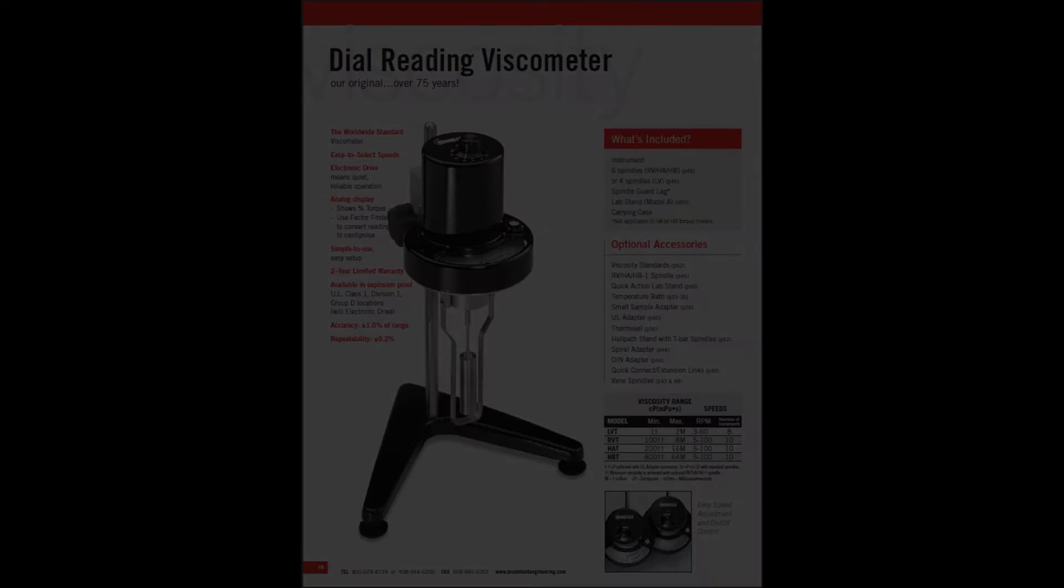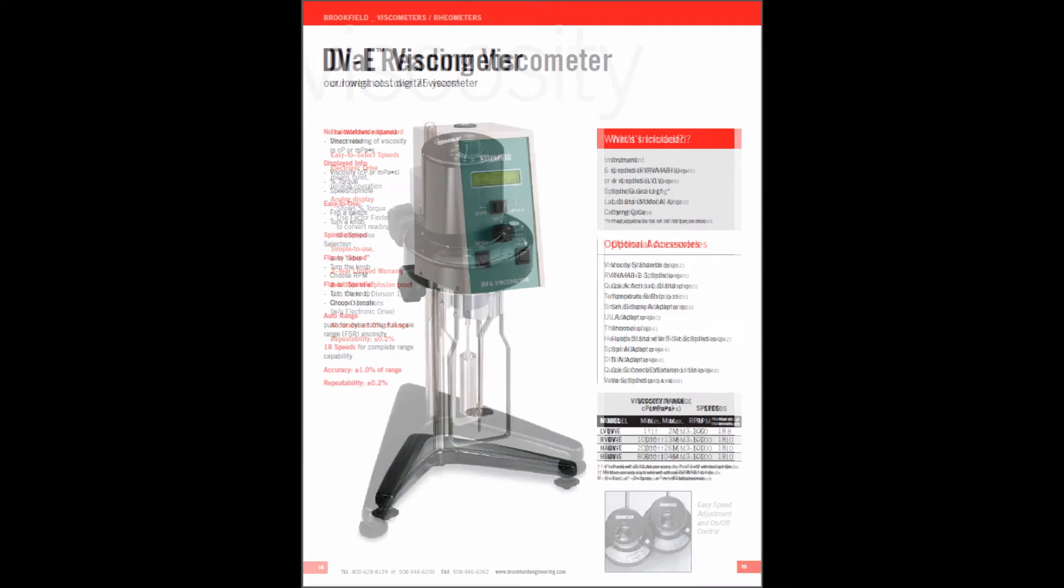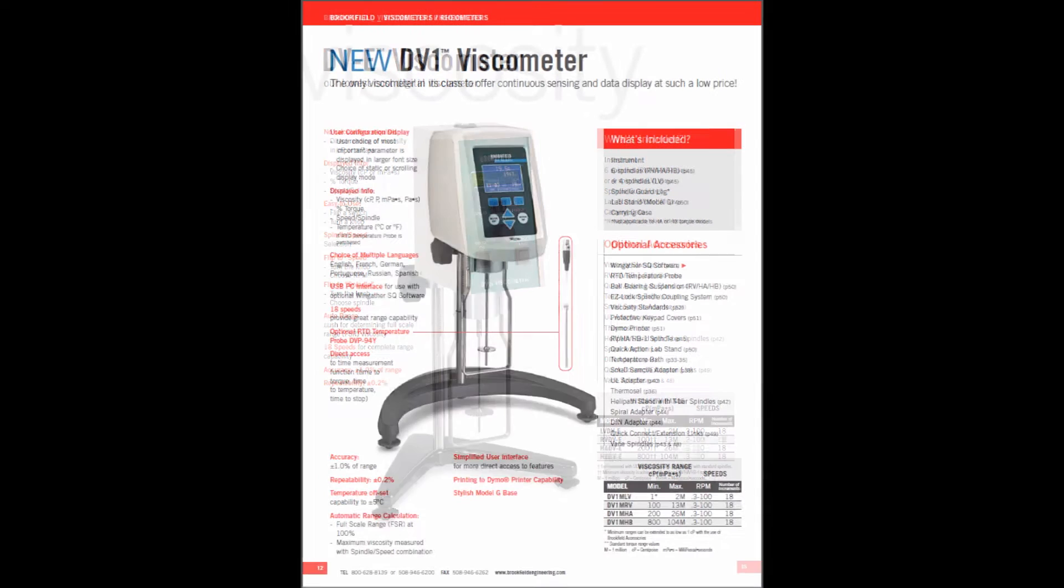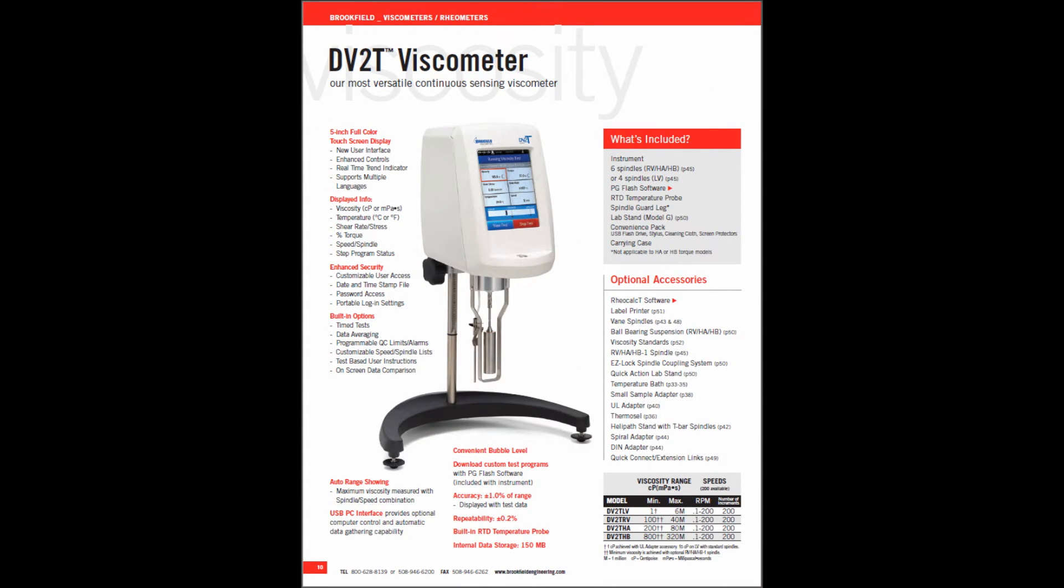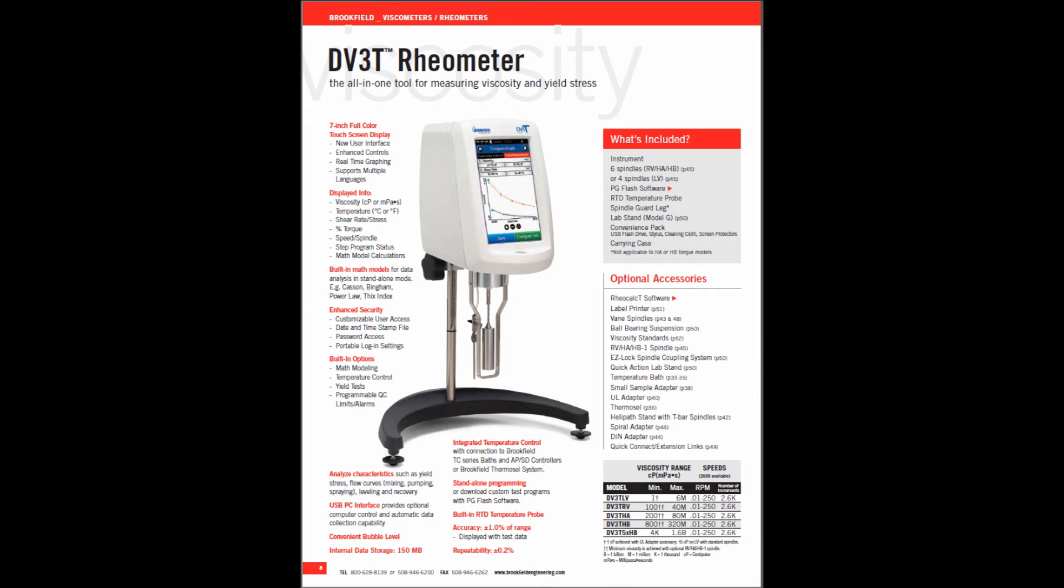The UL adapter is compatible with their dial reading, DVE, DV1, DV2, and DV3 series instruments.